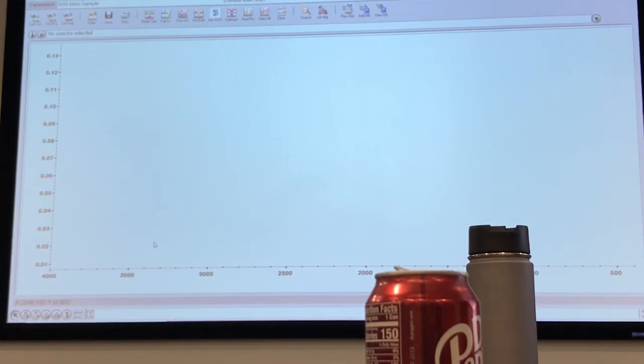Once you subtract something out, can you then run another match? Yes, that's exactly what we did. Then you run another match, and then you see what is in it.